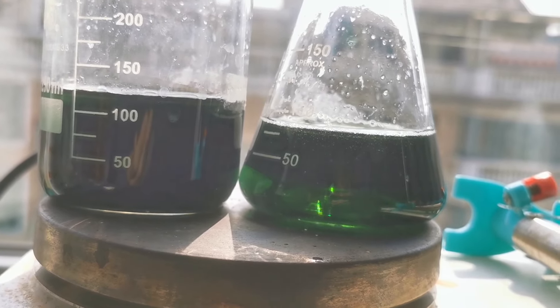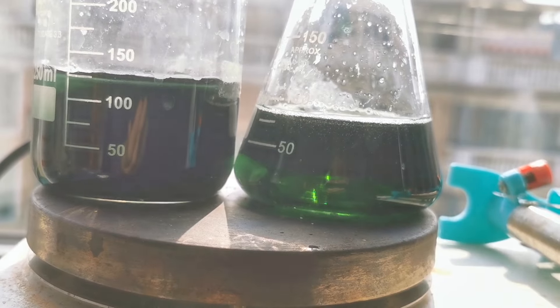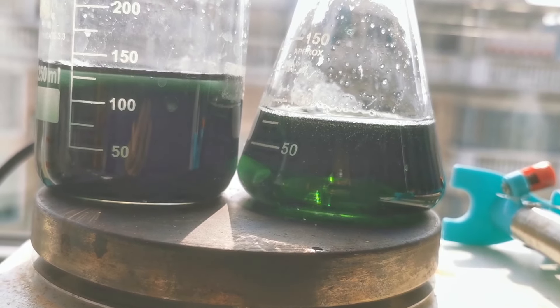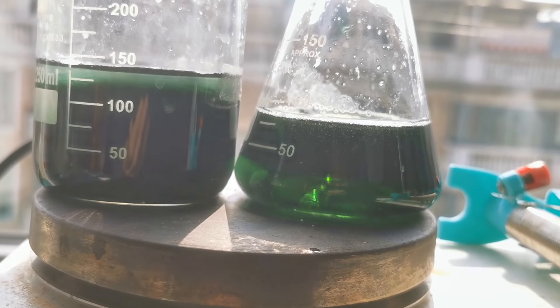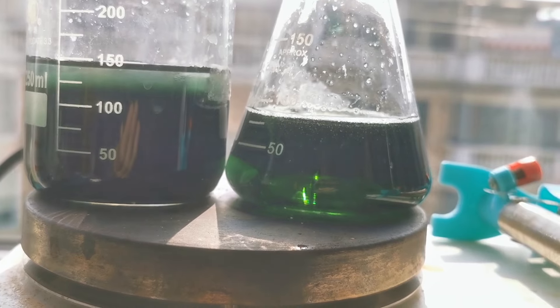I decided to do it the crude way and place the two solutions side by side. I then gradually added water to the saturated solution and compared the colors until they're about the same shade of green. Now, I know this is really inaccurate.